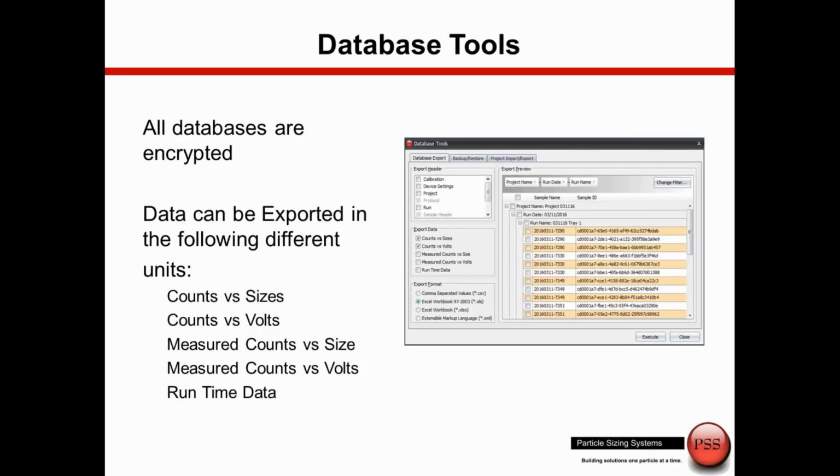Now there's also a lot more we can do in terms of organizing this data, because now all the data is stored into a database and we have various database tools to help us organize this data.